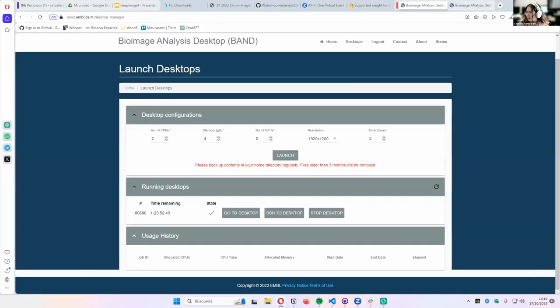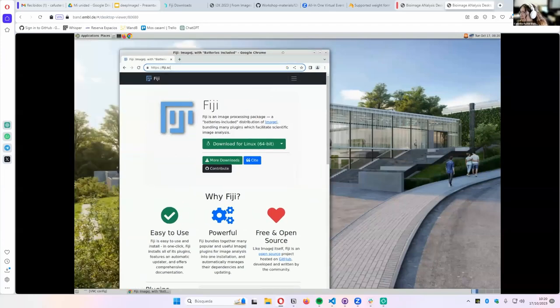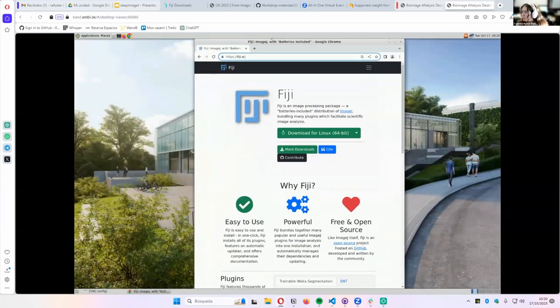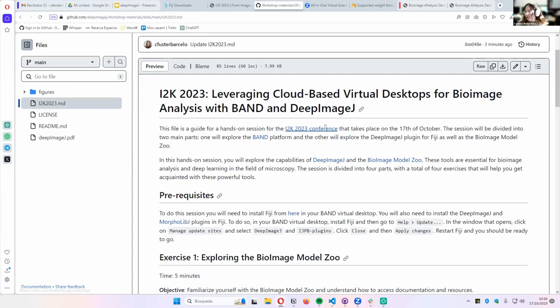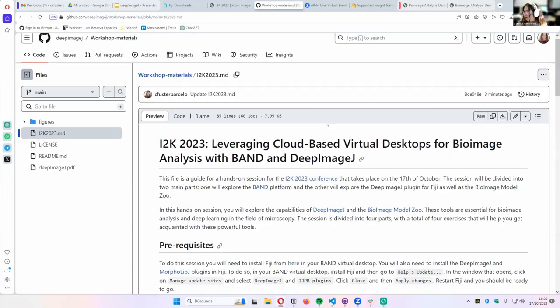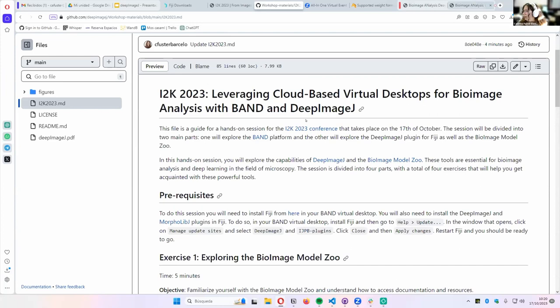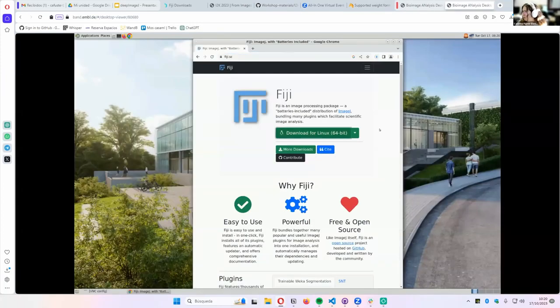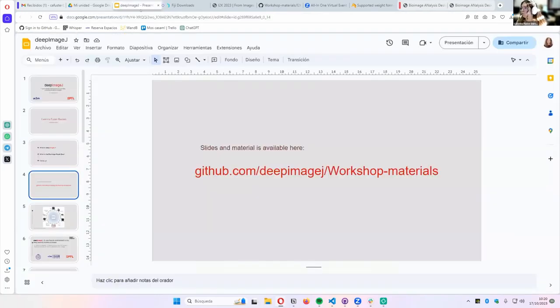If you open your BAND desktop, you'll have this desktop. What we have to do is a clean install of Fiji. In the Markdown file on the GitHub repo, which has the full guide for this workshop, you'll find instructions on how to download it. Basically you go to the Fiji website and download it. If you start downloading it now, it will be ready by the time I finish my presentation and we can start working.